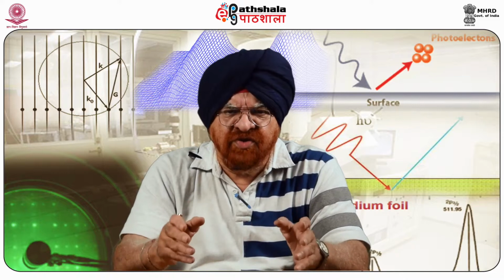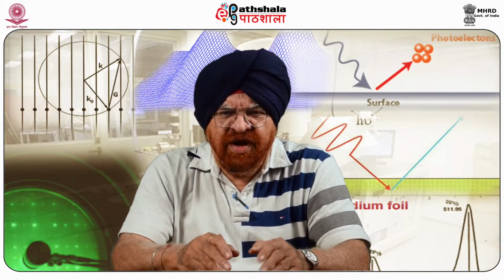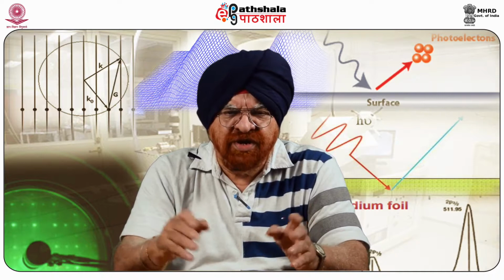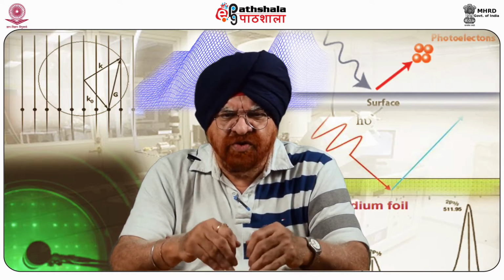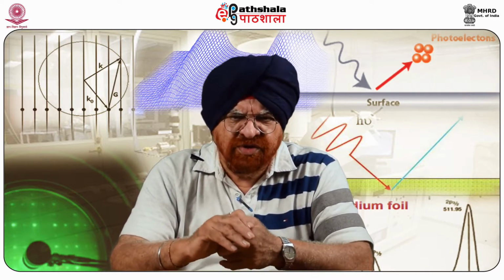When an atom or a molecule is subjected to high energy radiation, photons in the radiation collide with electrons in the sample, as a result of which electrons are ejected out. When a core electron leaves the vacancy, an electron of higher energy level will move down to occupy the vacancy while releasing energy in the form of photons or Auger electrons, which is what is being analyzed in this spectrometer.